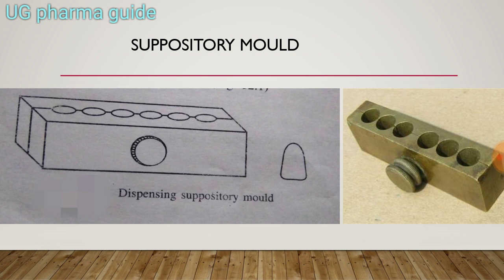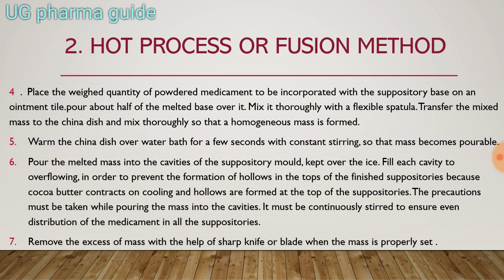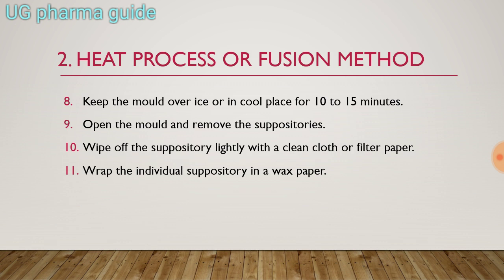Cut the excess so all suppositories are the same size. Open the mold and remove the suppositories once they are dry. Wipe off the suppositories lightly with a clean cloth and filter paper, then wrap the individual suppositories in wax paper.